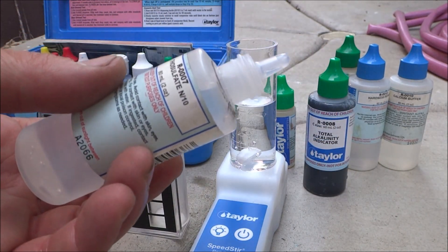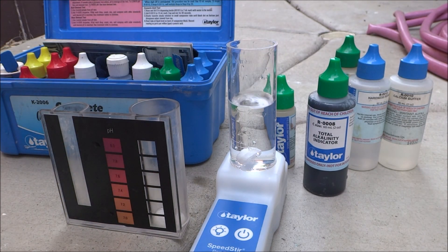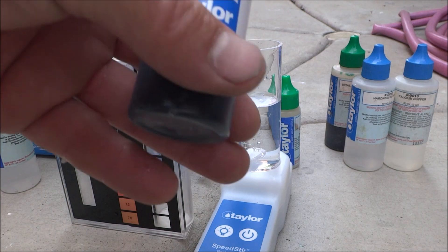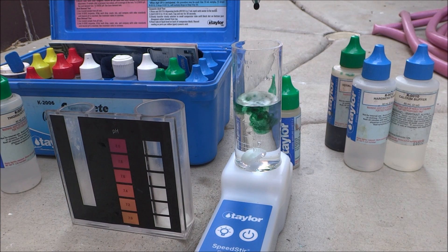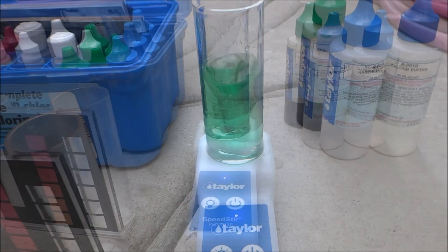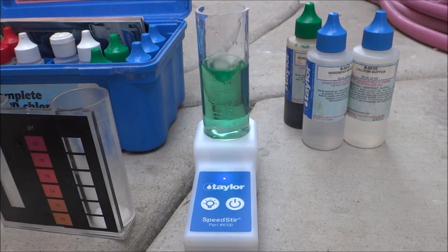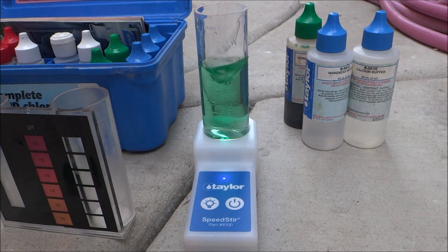Then you would simply add the reagents. I'm going to do an alkalinity test. Here's R007 — add two drops of this. I'm going to add five drops of R008. I'm going to turn the power on. So the Speedster will run for a minute or until you turn the power off. I'm going to add drops of R009 — count them.